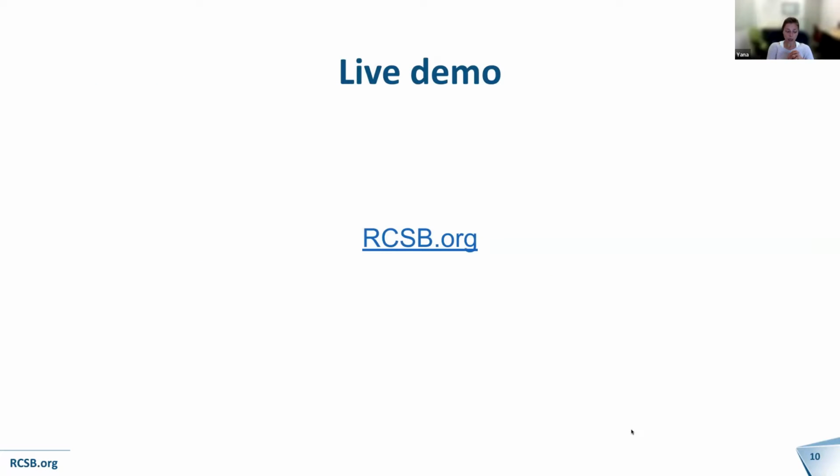And I will give a live demo. In this live demo, I'm going to show you how rcsb.org makes it easy to search, visualize, and access comprehensive information on protein structures and explore the additional value provided by computed structure models when applied to proteins with low experimental coverage, using the LDL-RAP1 protein as an example.